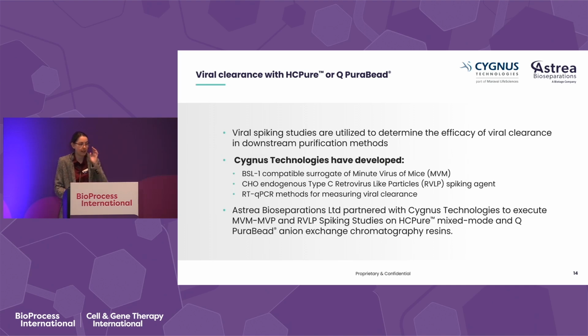So we were interested in this technology because when we're helping our clients, our customers, to use our products in developing their mAb purification processes, we need to advise on the types of experiments that they need to do. So if you're using our HC Pure, then we need to advise how to do the screen. Like I showed before, we always use product recovery and HCPs as our main examples. But we wanted to be able to add in viral clearance also when you're planning or developing these methods.